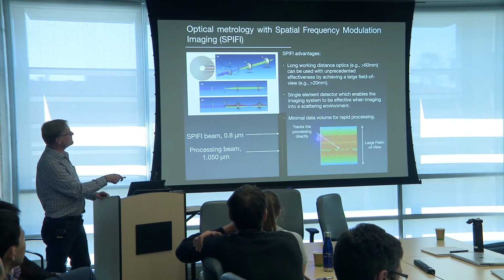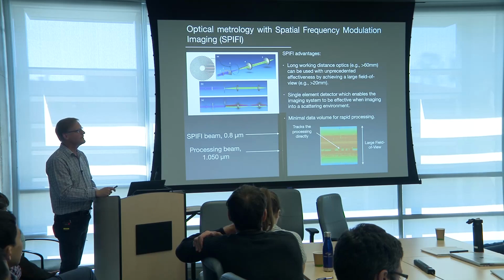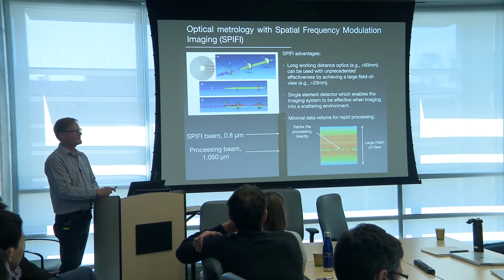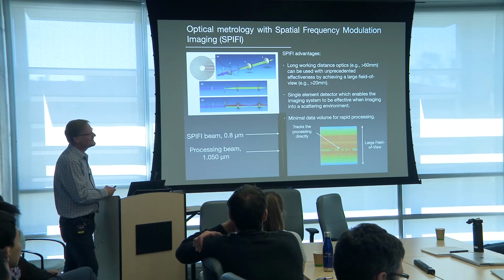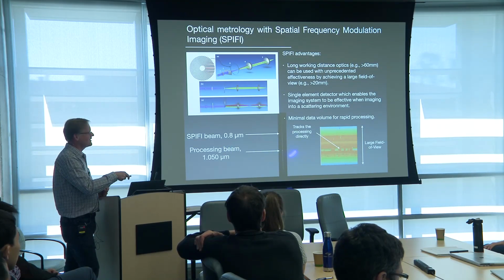So you're scanning from left to right or right to left in this image? No. In this case, where we're processing, you're actually dragging the material through the system. Here we're cutting channels, so we're making microfluidic plates. This builds on Emily's old work from ages ago. But you're dragging in the horizontal direction, right? Yeah, I'm dragging the plate this way. It can actually go in all directions.